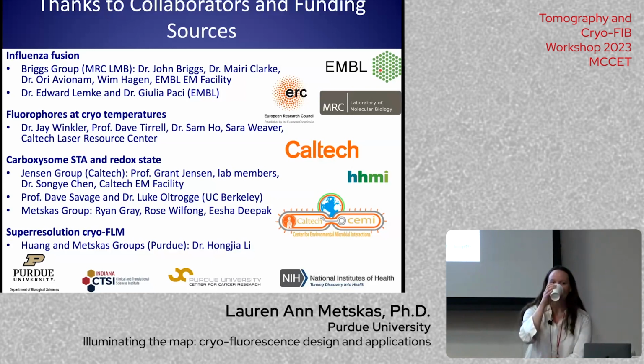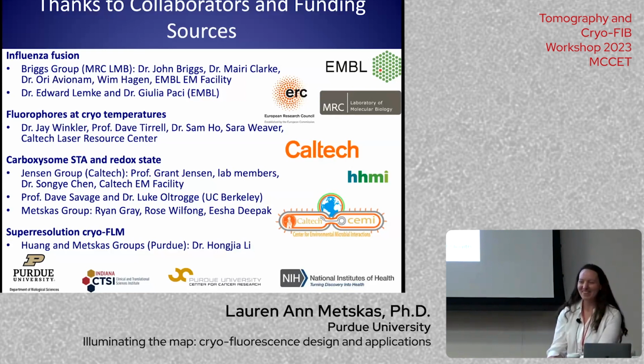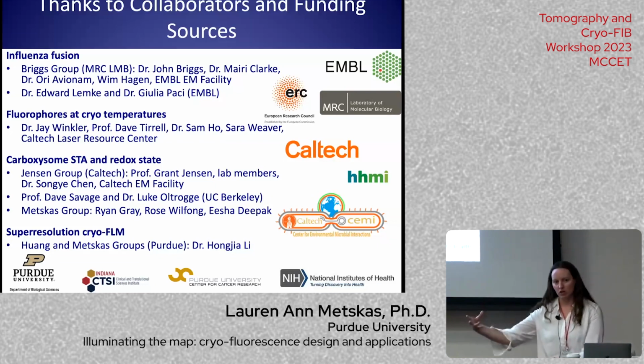We had one question from the online group. How are the performances of Atto dyes and Cy3, Cy5 series under cryo conditions? I'm trying to determine which to choose between. I like this person. So the Attos are beautiful. I'm working with the Cy5 right now, and it's also behaving very well. So I think in general, the response is going to end up being that all of the newest generation of optimized synthetic fluorophores are going to be very well behaved. Where we see the weirdness coming in is more with the older generation, like BODIPY, fluorescein, stuff like that, especially BODIPY because it has multiple dipoles.